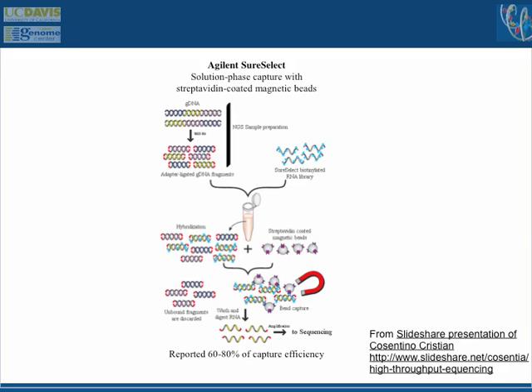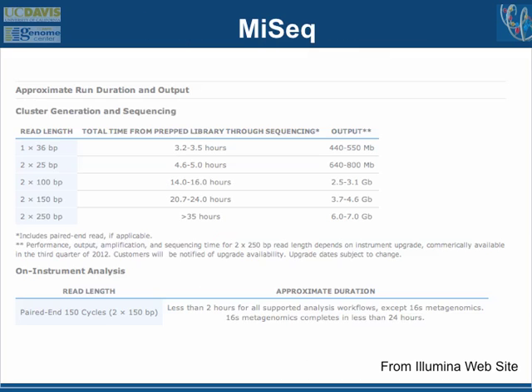So, about four slides back, what are the prices per run actually based on? I'll just tell you about the mini machine. The mini machine is about $1,000 to $2,000 in reagents for a full run. The HiSeq machine is probably $20,000 for the big machine. It has 4 flow cells.